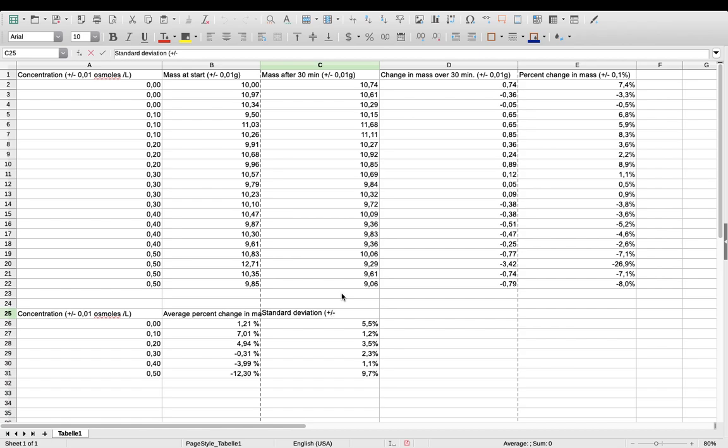And again, the measurement uncertainty and the precision are the same as the average that they were calculated from. So this would be my summary data table, getting right to the main information here. I've got an average for each value that I tested and the standard deviation.